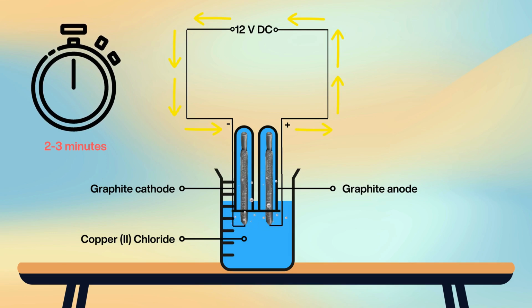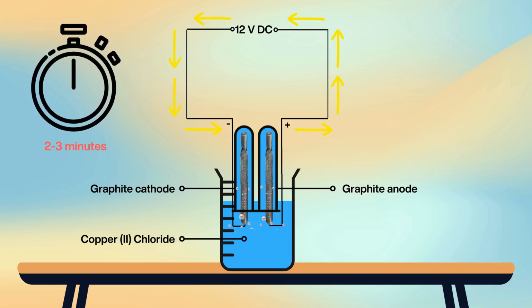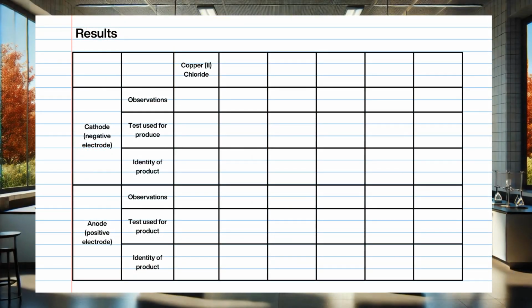Extending the duration could lead to side reactions or the buildup of unwanted byproducts, which might complicate the interpretation of results. After we have observed the reaction, we need to record our observations so that we can later identify the products that have formed.